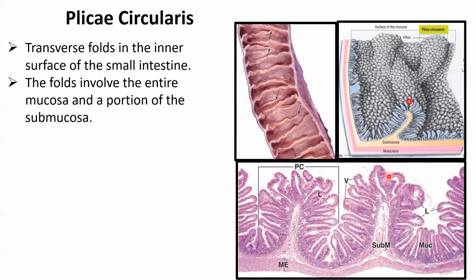This is the histological description of this. Again, muscularis mucosa, muscularis externa here, because they put the E, but the submucosa is here, and this makes these folds to form the plica circularis. This is the epithelium, and then this is the mucosa, correct? Epithelium, lamina propria in between, and then muscularis mucosa, which you cannot see.